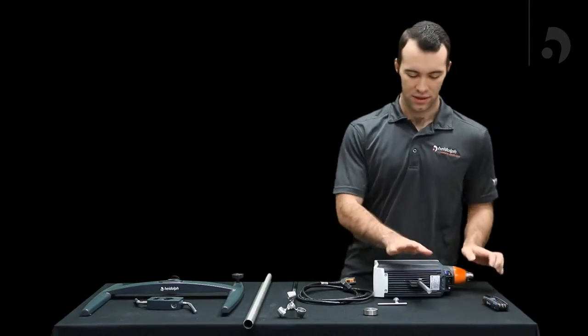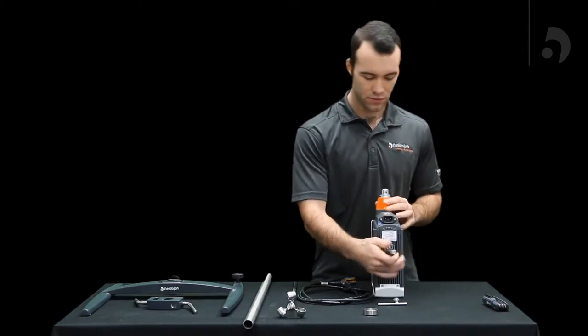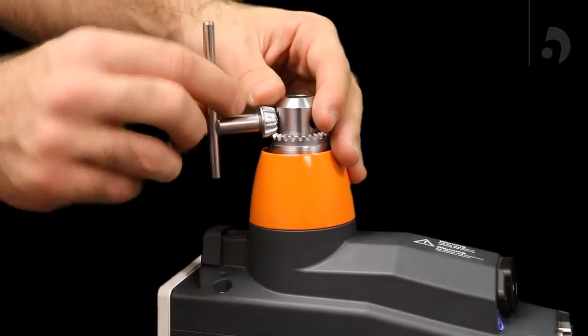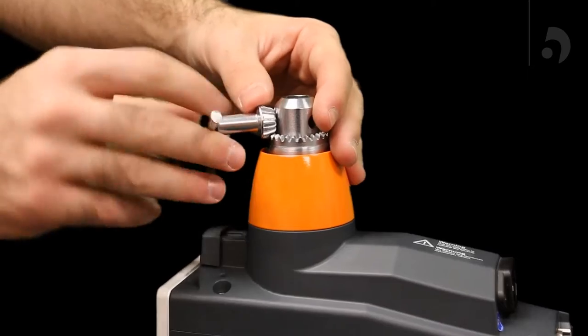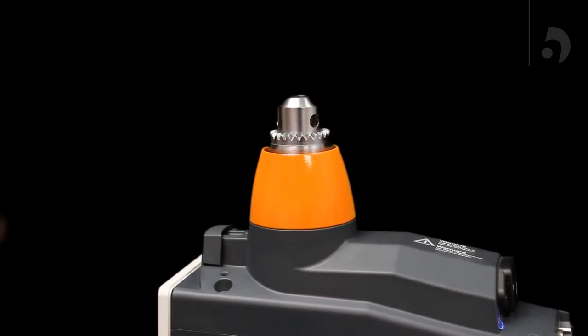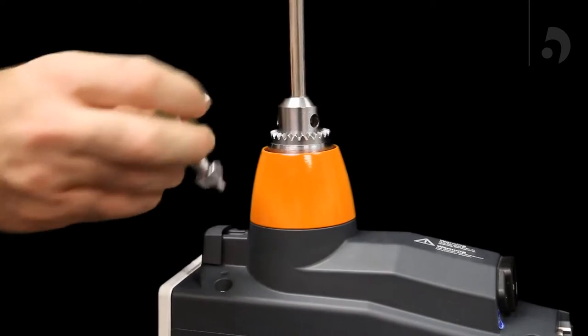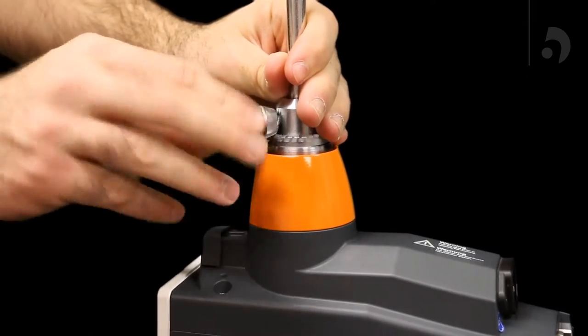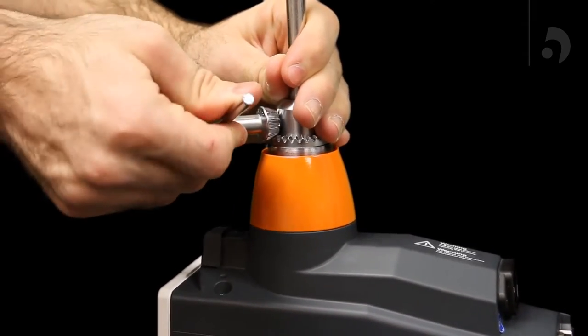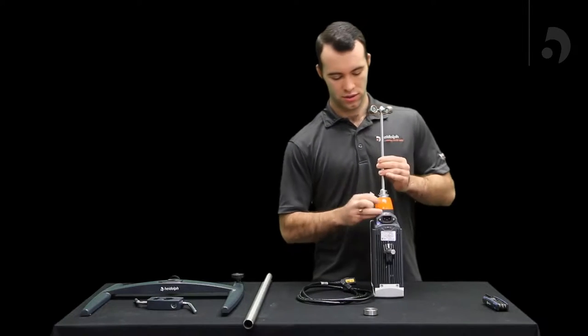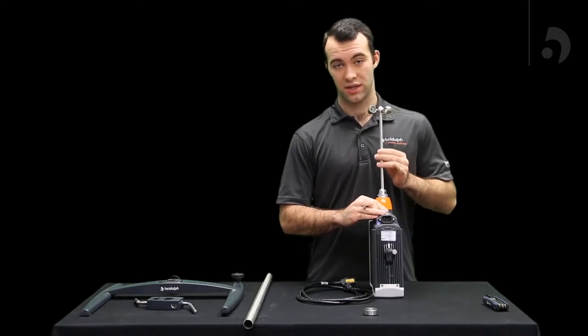Then once you have the support rod in tight, you flip it over using your chunk key, loosen up what will be holding your impeller, and then insert it in to about the appropriate height you desire and again using the chunk key tighten it. Make sure it's in there very snug so when it's rotating it doesn't get loose.